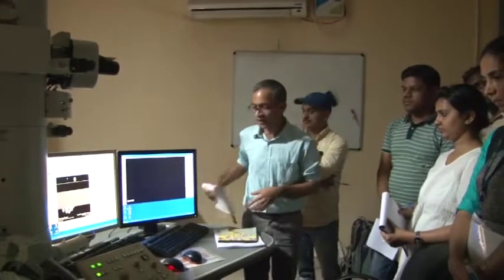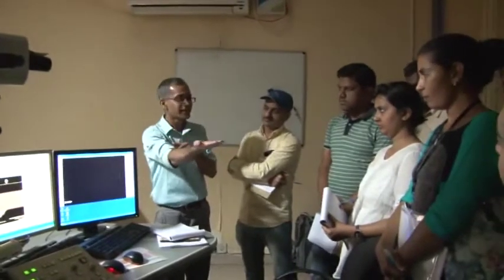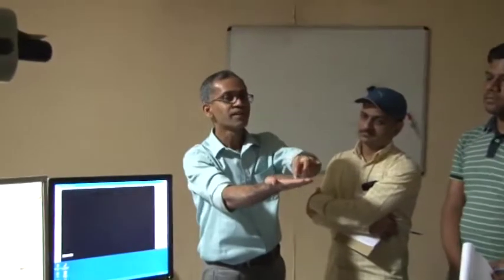Which means that it's almost like this hand is my holder, for example, and the sample is somewhere here. The sample size is 3 millimeter. In this case, these were gold nanoparticles. They were deposited on a copper grid, and that grid of 3 millimeter diameter is sitting somewhere here. Now, single tilt holder means the only tilt that is possible is like this.